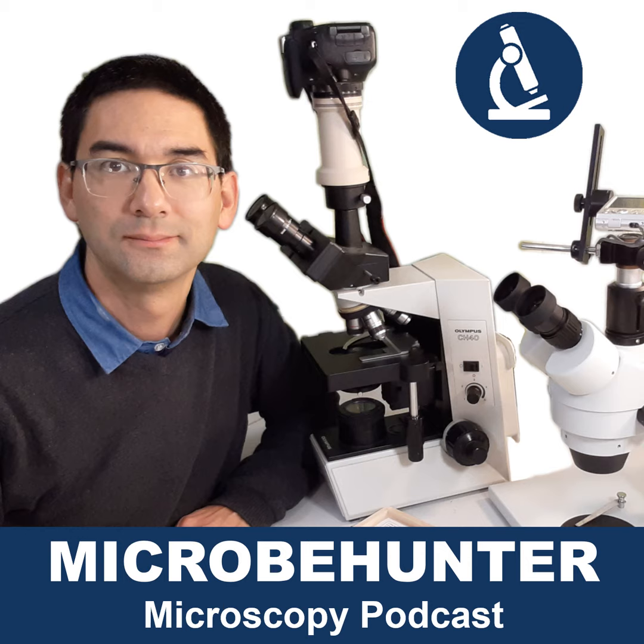I would say that in most cases, if you're inexperienced, the oil immersion objective might cause more problems than it resolves. With the oil immersion objective, it comes along with so-called immersion oil, and you have to put a drop of immersion oil on the microscope slide, and then rotate the oil immersion objective into the oil.